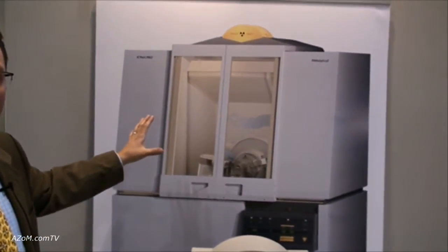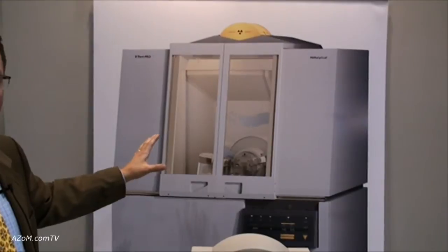This is our main system enclosure. It's designed as a radiation safe enclosure for X-ray materials analysis by X-ray diffraction.